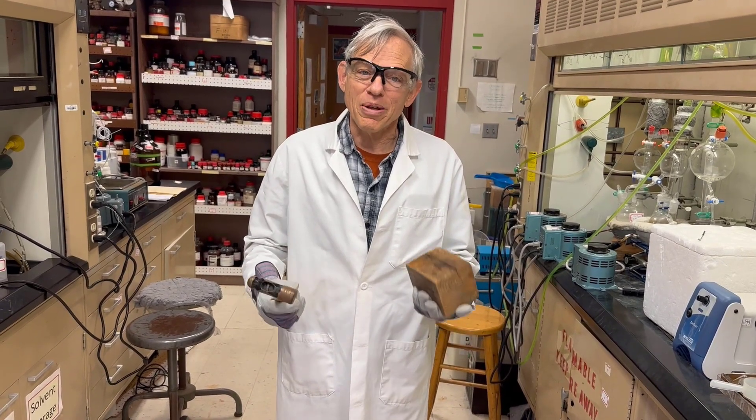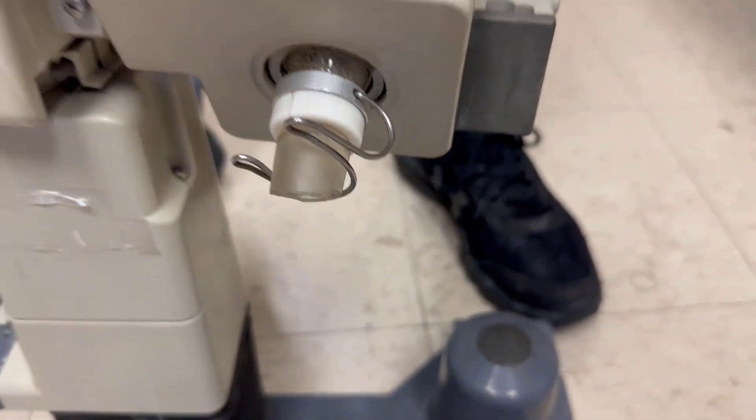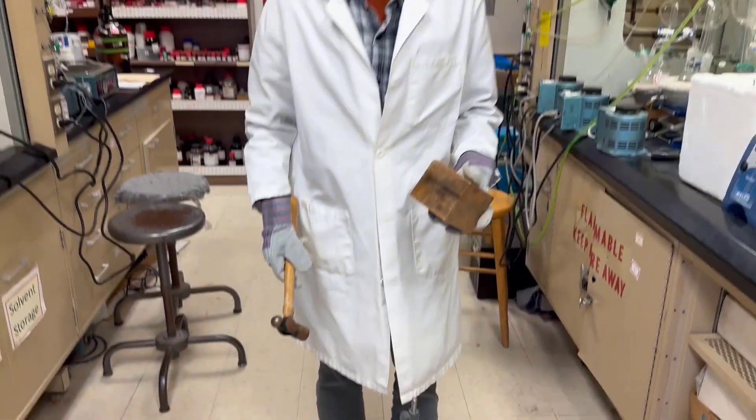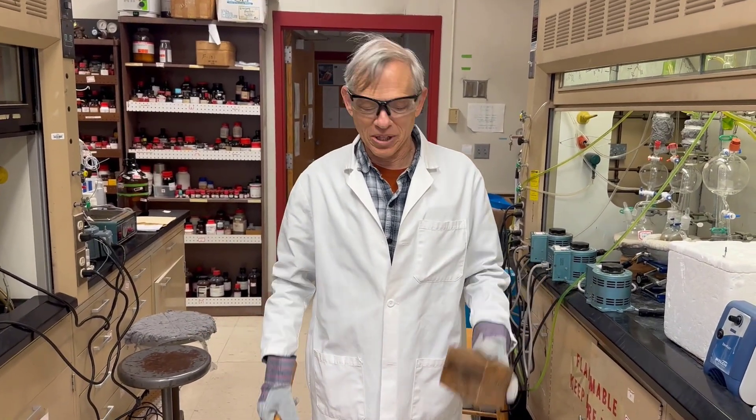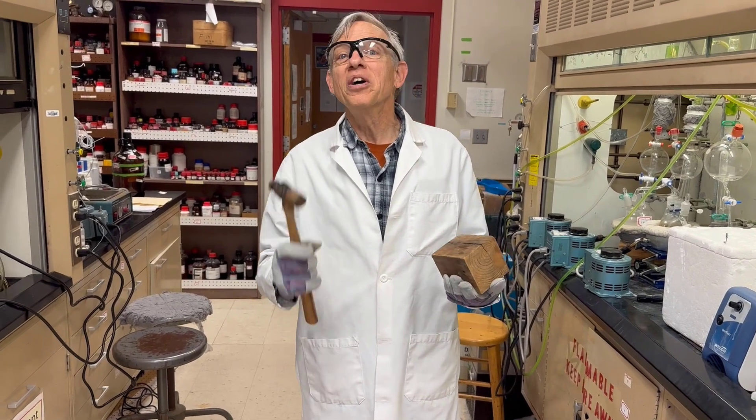Today we have a rotary evaporator with a broken steam duct. You can see the steam duct — it is chipped at the beginning, so it's missing half of its ground glass joint. This is not uncommon. I find a lot of them in the lab this way, and Anvesh asked me today if I could remove the steam duct.